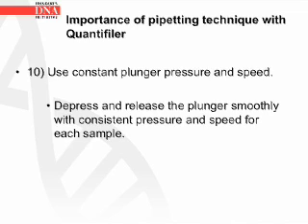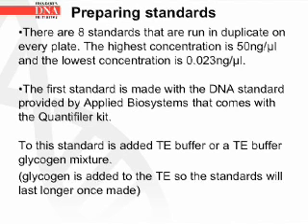Depress and release the plunger smoothly with consistent pressure and speed for each sample. Now that you know the keys for better pipetting, let's go into how you prepare the standards.